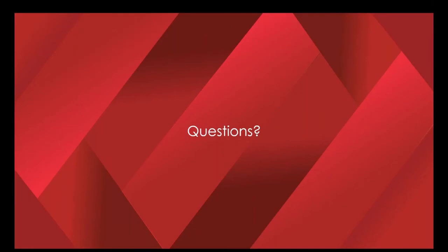Looks like Landon, did you have a couple questions that you'd like to take? Sure. So a couple questions came in. The first one being, can DIC be used for an indentation test? For an indentation test, that really is a three-dimensional deformation that needs to be tracked. DIC as it stands is a 2D system, so it really is looking at a flat surface.